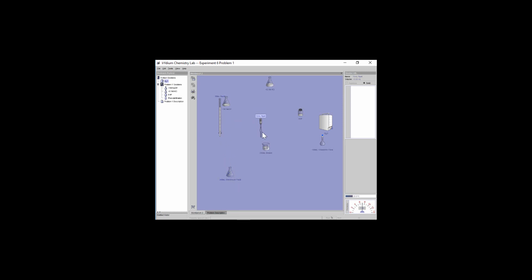So I'm going to drag my pipette here into the beaker. Again, there's that transfer bar on the bottom. Because this is a 10 ml pipette, I'm going to transfer in 10.00 if I can. This time, instead of just pouring, like dropping out solution, I can actually withdraw. So I can suck up the solution. The pipette, like the volumetric, is really well calibrated. So you notice this 10 is actually 10.00. I know this concentration very well. I'm going to transfer that 10 into my Erlenmeyer flask. So doing that there, right?